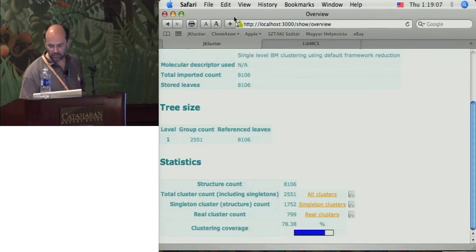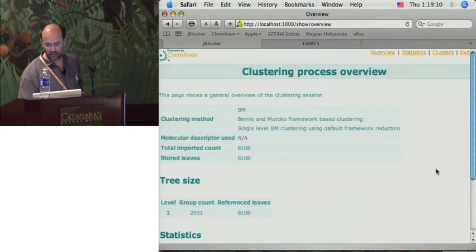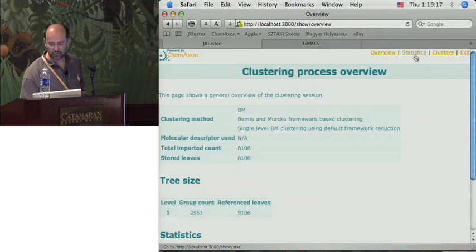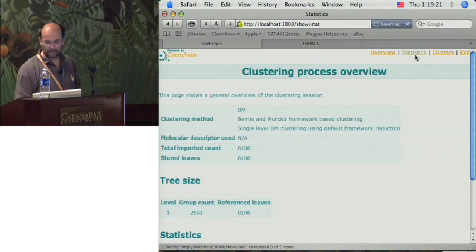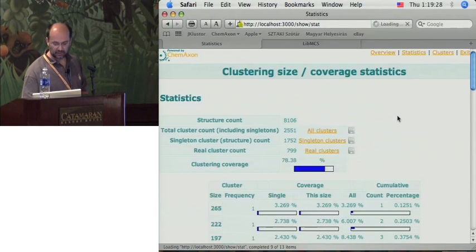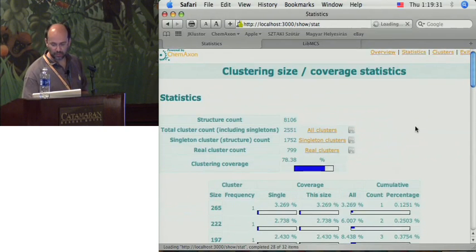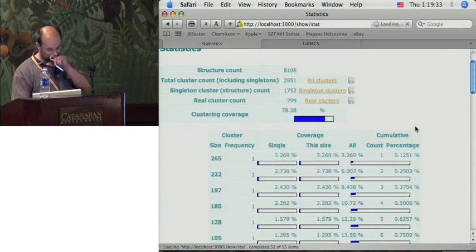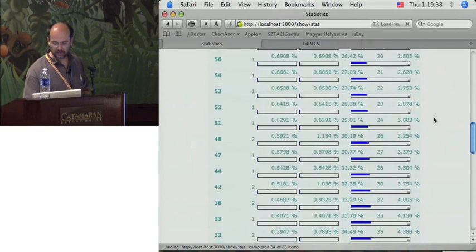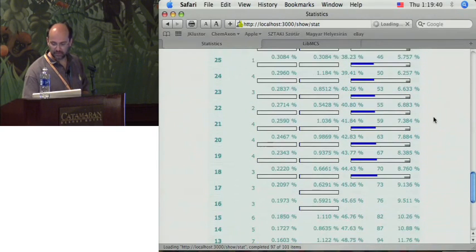And then you can immediately save this if you click this button or icon. You can save your clusters, but you can get a much finer resolution statistic. Okay, so the overview in the top, and then a very detailed coverage along with these line bars.